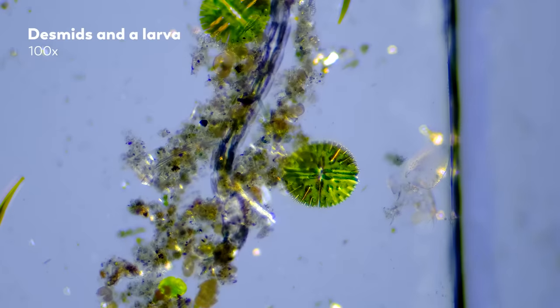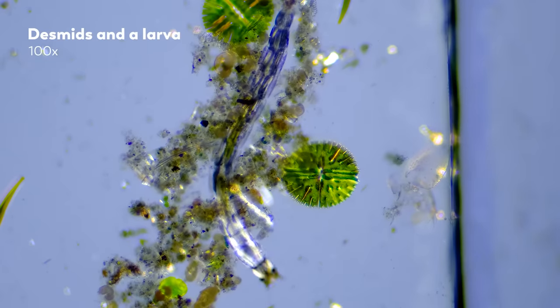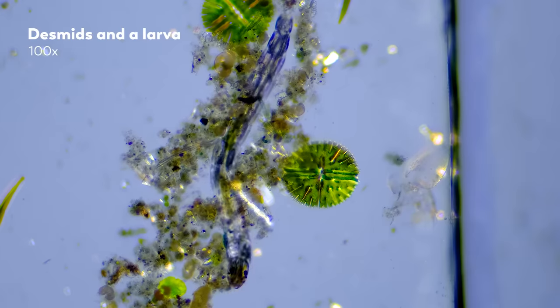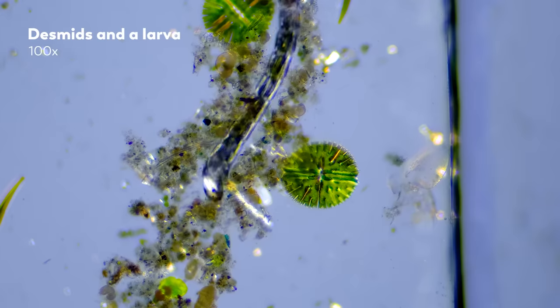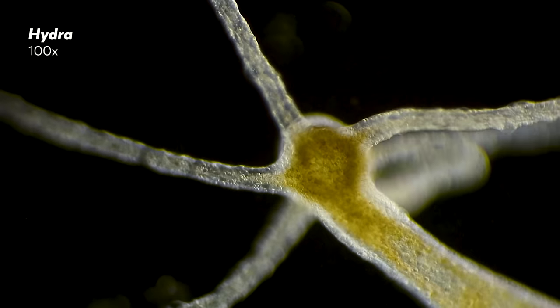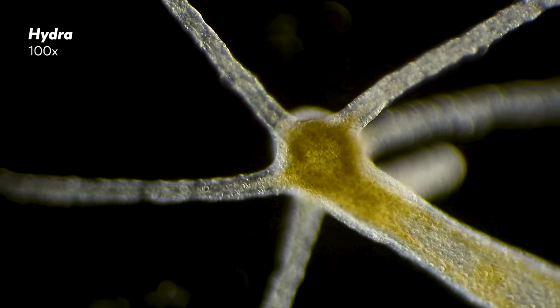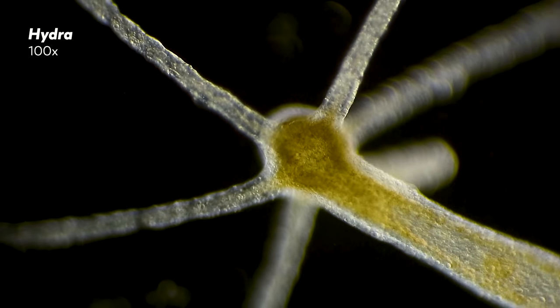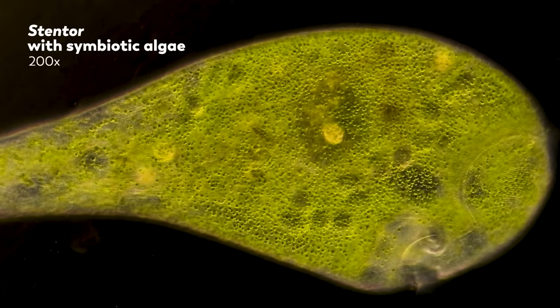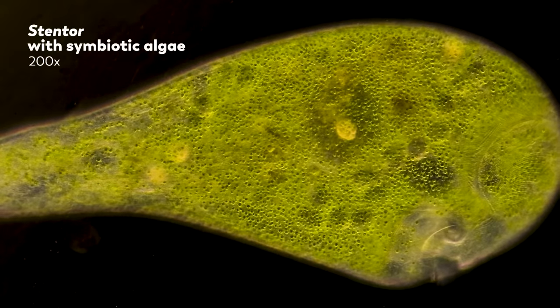Now, to the most frequent question of all — our equipment. When it comes time to get a closer look at our cultures, we've used two different microscopes to film the footage you've seen on this channel. The first one is a microscope that James cobbled together from various parts for just under $200, creating hundreds of hours of recorded footage that we still use. So this one is a Microcosmos original — you can't buy it, there is only one, and there is no brand name.